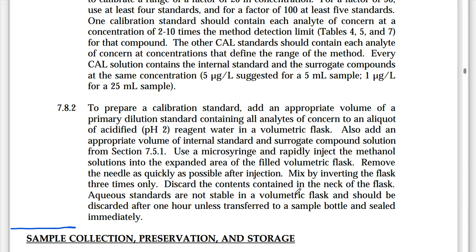Not only is it giving us procedure details, but it is straight up telling us how to make some of these solutions, many of them actually, in a laboratory method. So I would take these paragraphs, break them down, and make sure that these are incorporated in a SOP in some form or fashion. That way our lab workers are following straight up directions. They don't have to think about it. They don't have to do any math. Just follow the directions and you will be able to bake your cake.